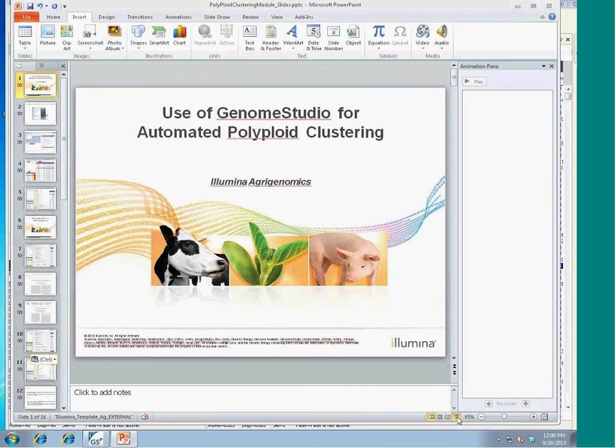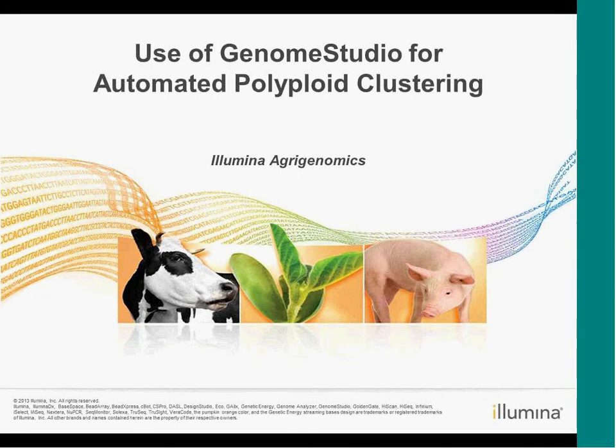Hello and welcome to the use of GenomeStudio for automated polyploid clustering. The purpose of this short demonstration is to introduce you to the features of GenomeStudio's polyploid clustering module, which is being launched by Illumina in conjunction with the GenomeStudio genotyping module.